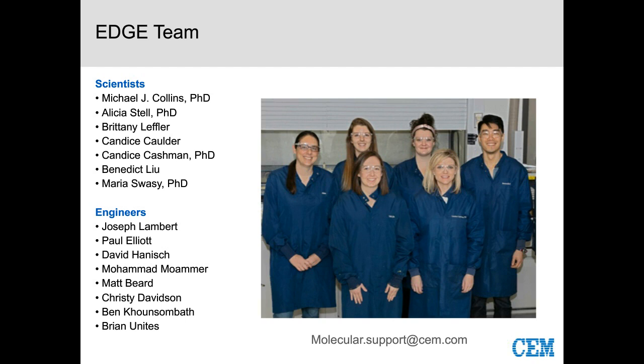What you do is weigh whatever sorbent you need for cleanup into the Q-cup. As you prepare your Q-cup, you put the Q-disc in, assemble the Q-cup, put it on your balance, and then weigh in the sorbents that you need to remove those interferences. So if you needed some graphitized carbon black, you would weigh that into the Q-cup at that time, then add your sample, and then drop that in the Edge. So that cleanup step is happening during the extraction process.